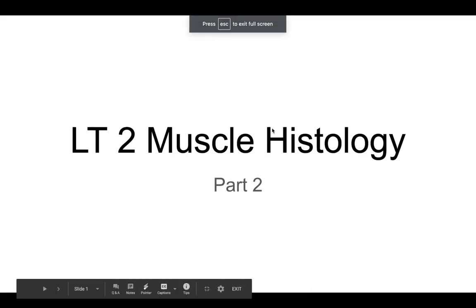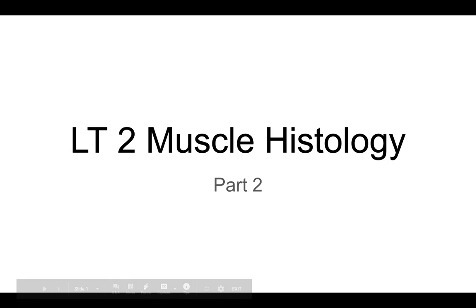Hey guys, we are in our LT2 section of the muscle unit. So this is all about the histology of the muscular system.